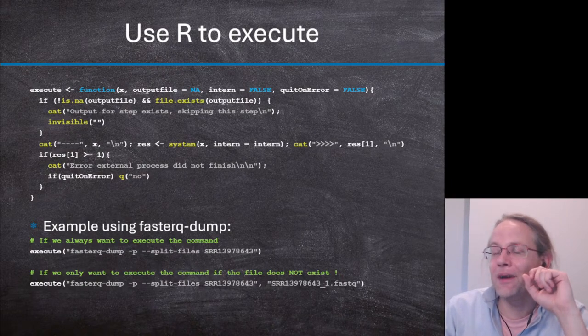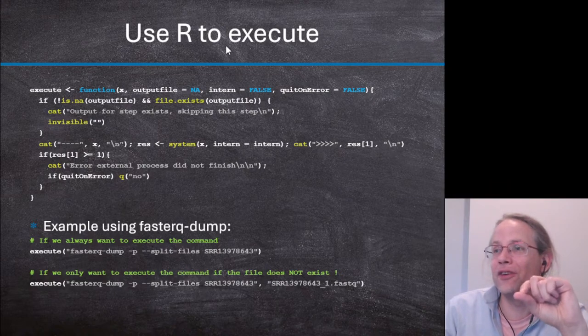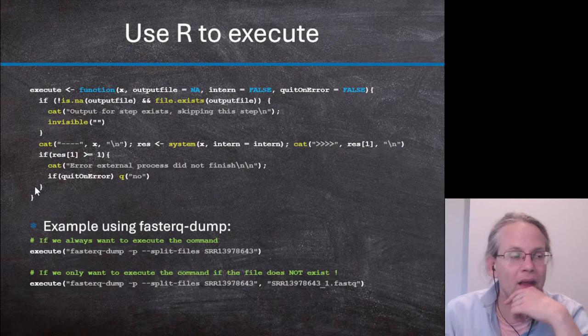Anyway, so we're just going to use R to execute, right? So we could have used the system command, and I'm still using the system command, but I wrote a little function which goes around the system command.